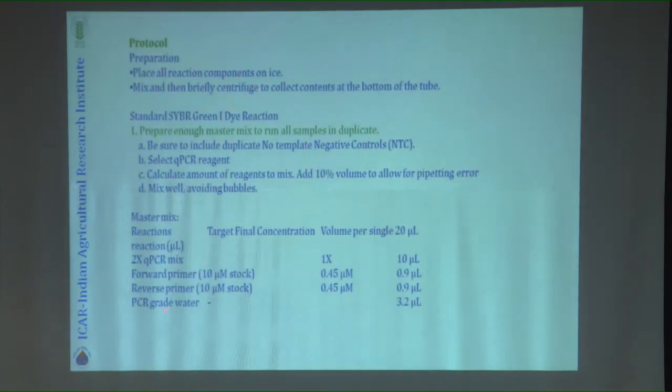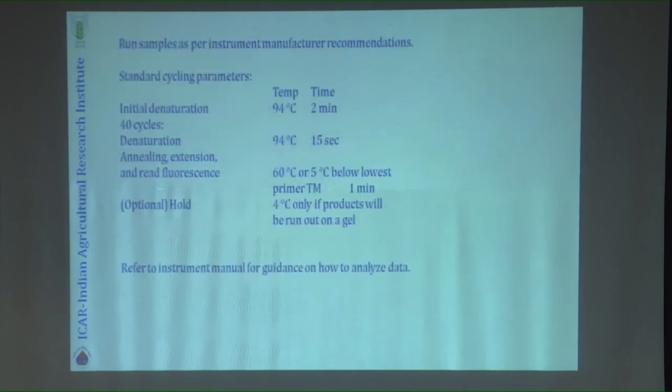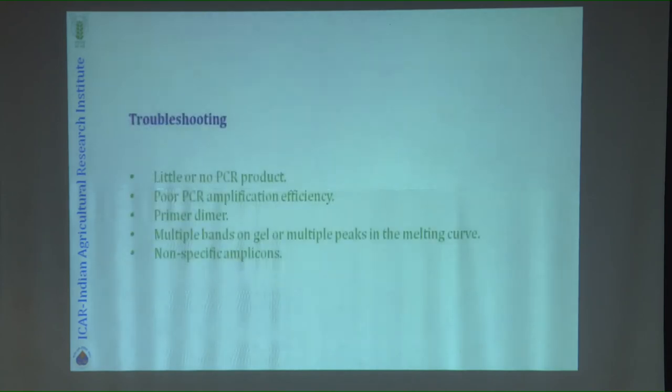Well, there are several protocols which are available on the net, the web, or in the laboratories of several professors, okay, you can use them. But all you have to do is standardize these protocols in your laboratory. Unless you have your own standardized protocol, success is going to be a little difficult. Not difficult, it is even difficult to see. Sometimes you will have all your reactions go wrong without any amplification. It will all look like NTC, no template control, no amplification at all. So you will waste a large amount of money on your reactions. Okay. So standardization is very important.